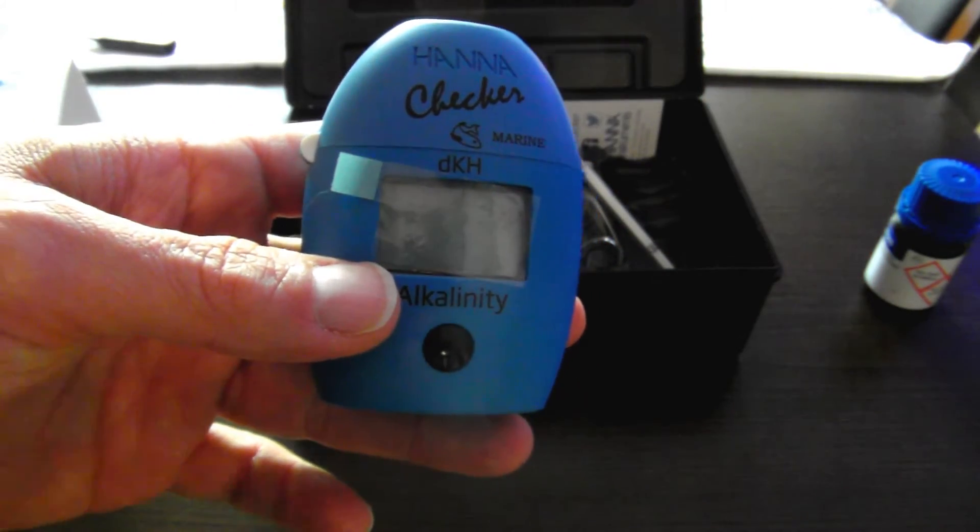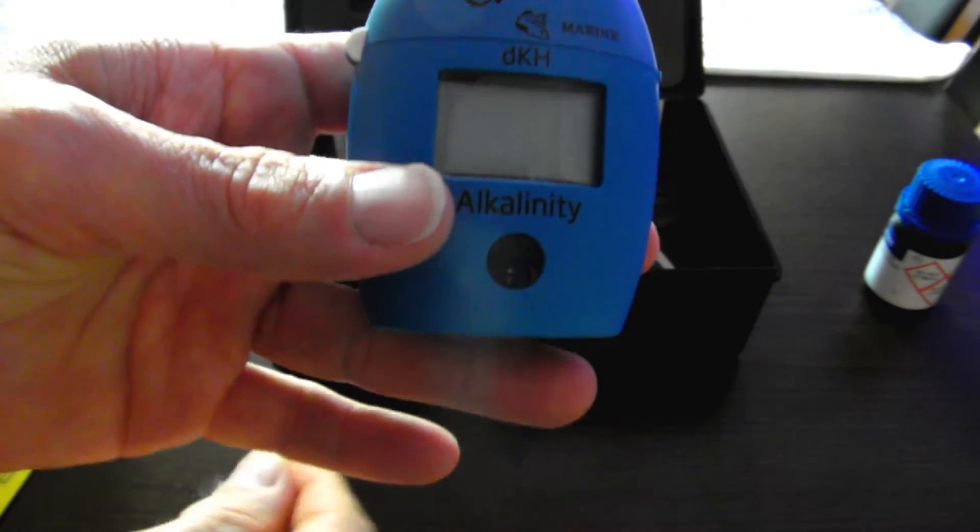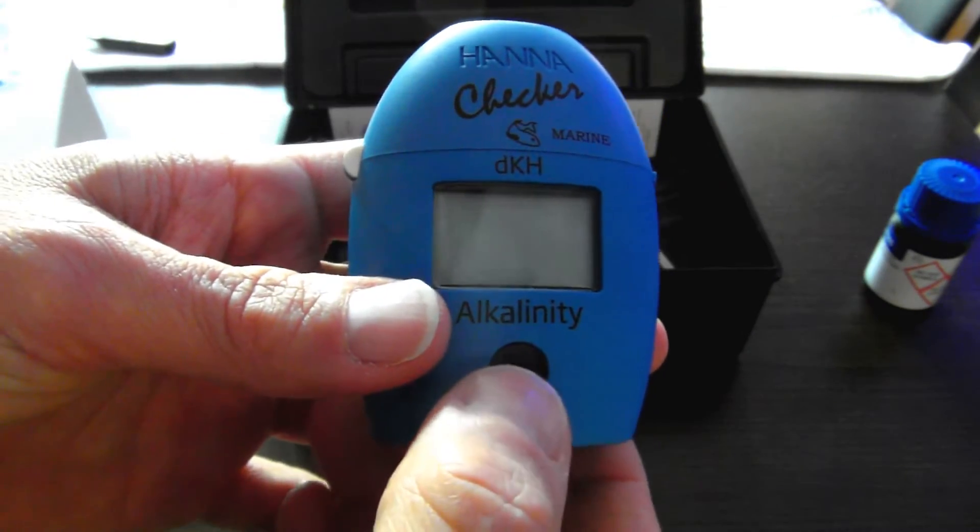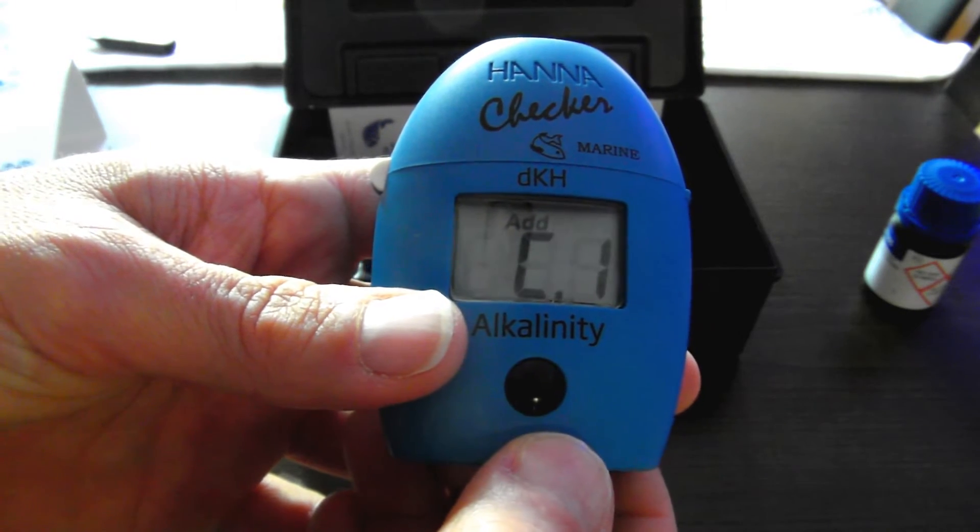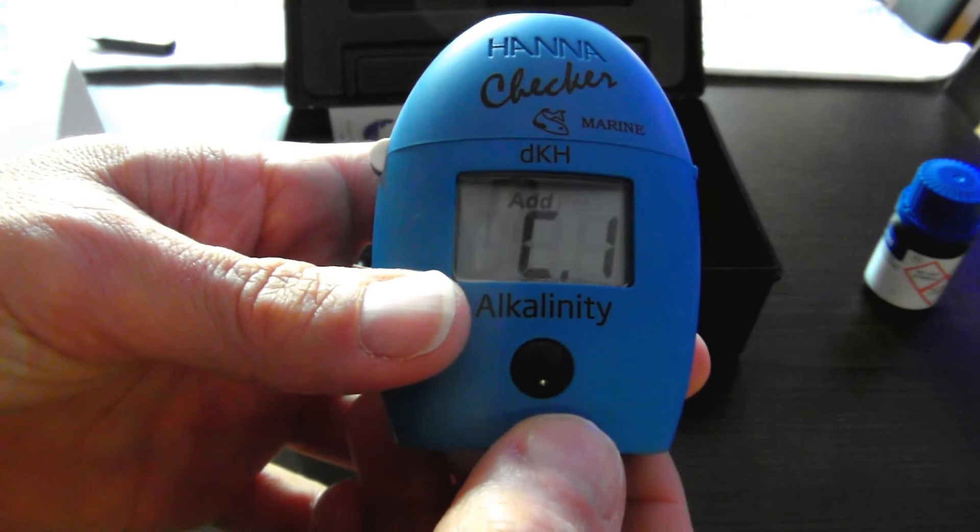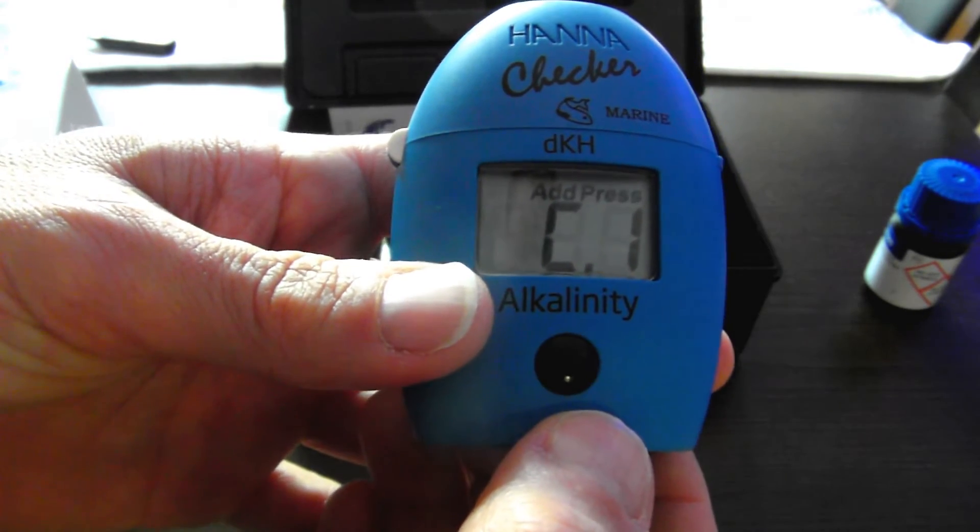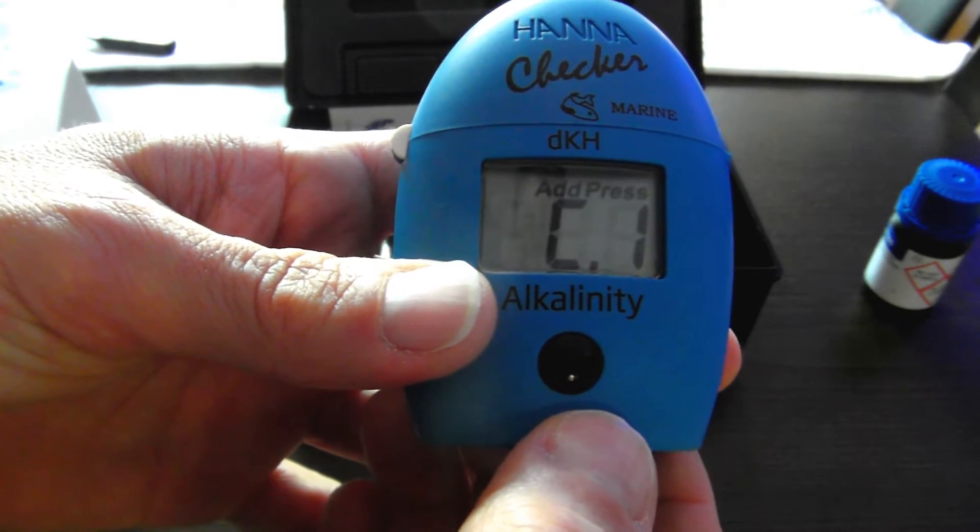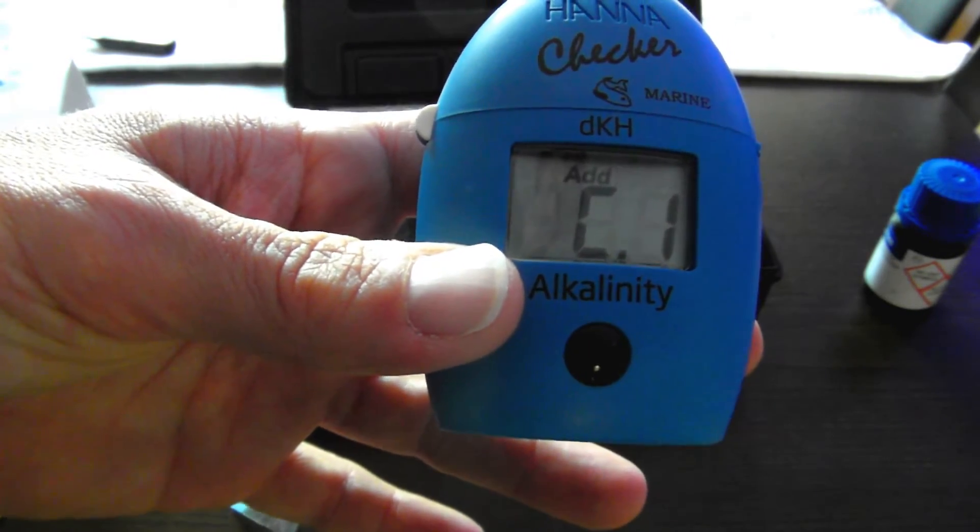Now with the battery installed, I'm going to remove the protective plastic off the LCD display and power the unit on by depressing the black button. All right, now the instructions say that when it displays C1, it's ready. So let's go ahead and prepare a sample and test it.